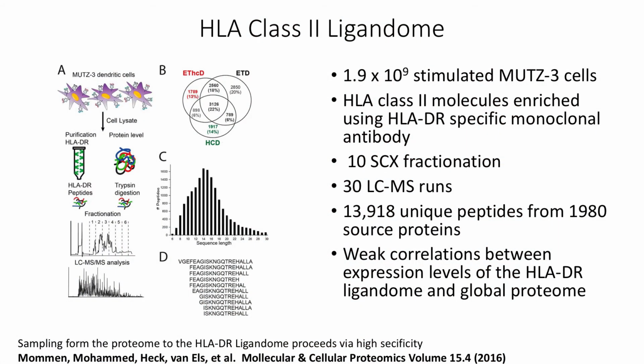So again, I told you just how difficult it is to interpret or misinterpret or miss something, so take this for whatever you want. And they found 365 phosphopeptides, and a third has never been reported in the literature. And the literature that's reported is probably all tryptic peptides. So here we have peptides that might have never been generated from a proteome before, and that's why we see them. And of all of these 80,000, they detected 11 of these neoepitopes. So 80,000 versus 11.